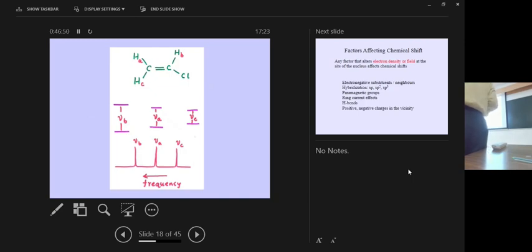What is the chlorine group doing? The chlorine group has the tendency to withdraw electrons. Okay? And of course, this effect will be relayed through the molecule. To what extent it will go, it will depend upon the structure of the molecule. Now it sees that this one will have the maximum effect, then followed by this one, then followed by this one. Therefore, all these three will have different screening constants, sigma i. Therefore, they will absorb energy at different frequencies. And you have three different frequencies here.